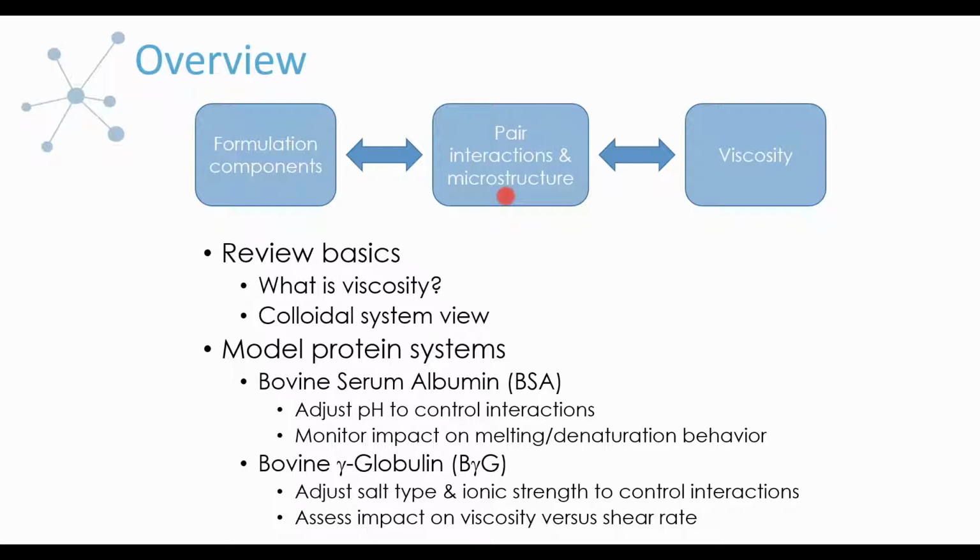So as we go through this process, just quickly I wanted to review the basics. I always like to bring up what is viscosity. I know a lot of you do that measurement, but maybe some of you don't. But I always like to highlight what it is so that it's very clear why viscosity is so sensitive to what's happening on the molecular level. And then I want to introduce the idea of colloidal systems and how they're viewed, and how we can start adopting ideas from these systems in interpreting viscosity data.